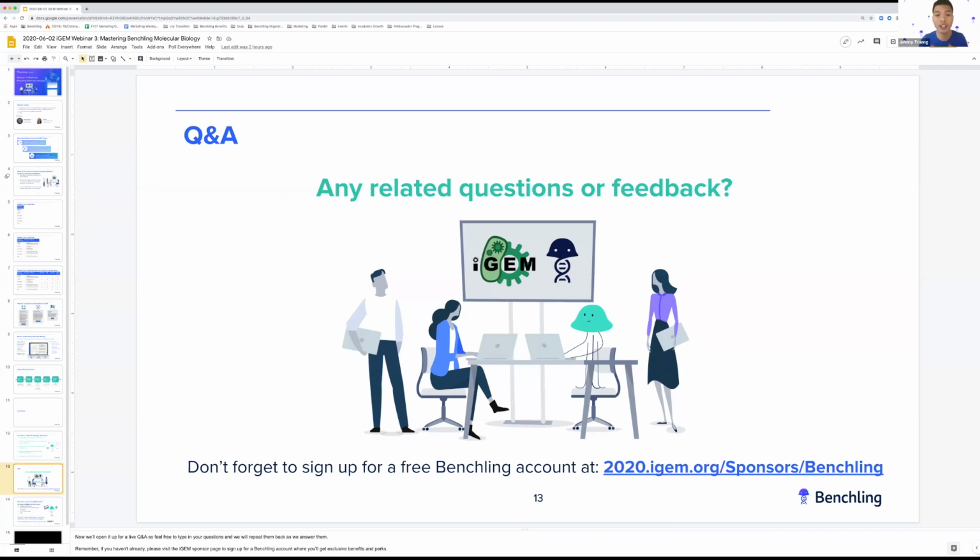Maybe you need to send off a different clone. And so that's the part where Benchling really helps with the science. But unfortunately, we can't interpret the science for you. We can only help you visualize it easier. Is there anything you'd like to add to that, Sierra? No, that was a perfect explanation, Johnny.